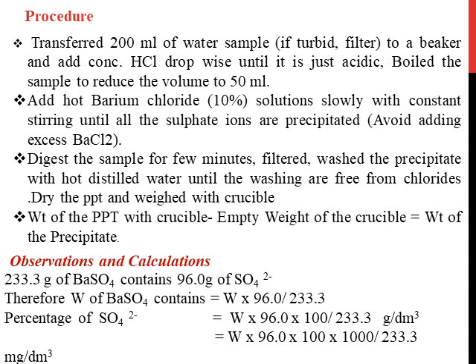So this boiling serves to concentrate the sulfate, that is, to increase the sulfate concentration. Removal of the excess water will increase the concentration of sulfate. It will help in the precipitation process. So boil the entire solution and reduce the volume to 50 ml.